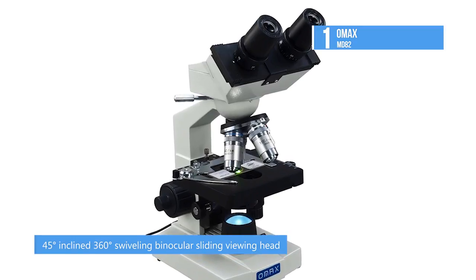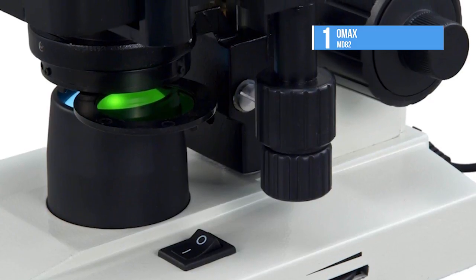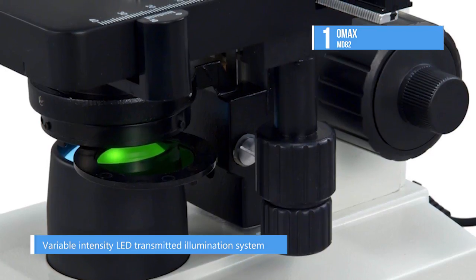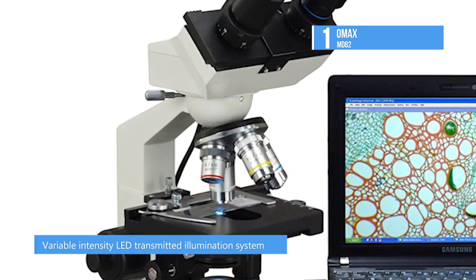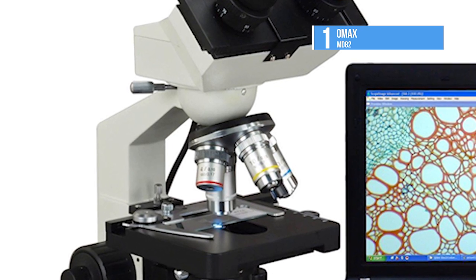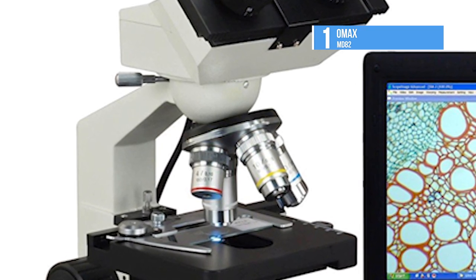It also features a stain-resistant double-layer mechanical stage with scales, coarse and fine focusing on both sides, NA 1.25 Abbe condenser with iris diaphragm, and variable intensity LED transmitted illumination system. This type of microscope is perfect for homeschool, teaching, demonstration, clinical examination, laboratories, and advanced applications.